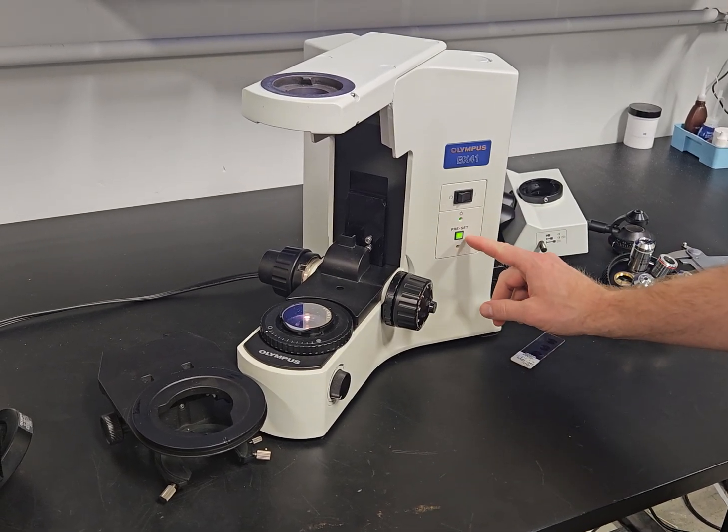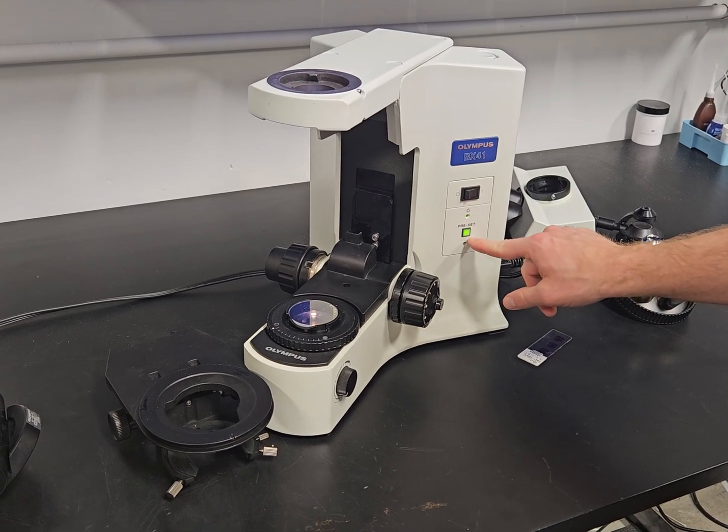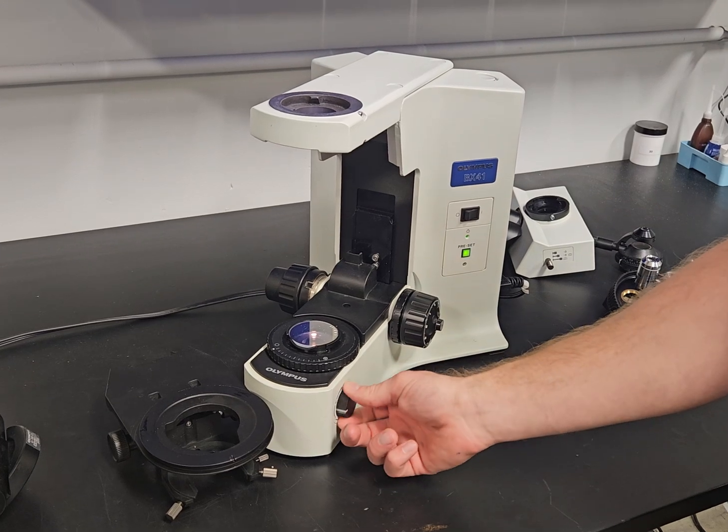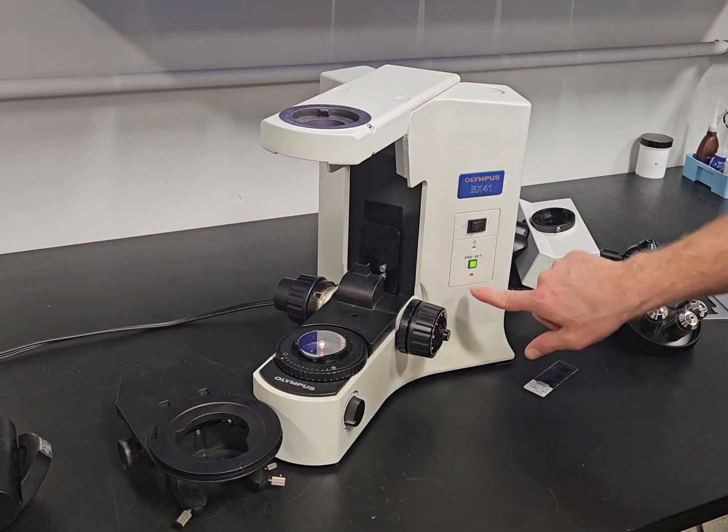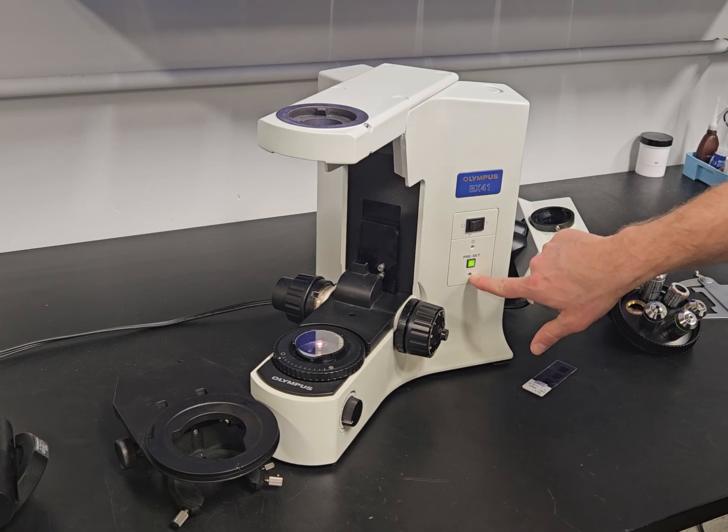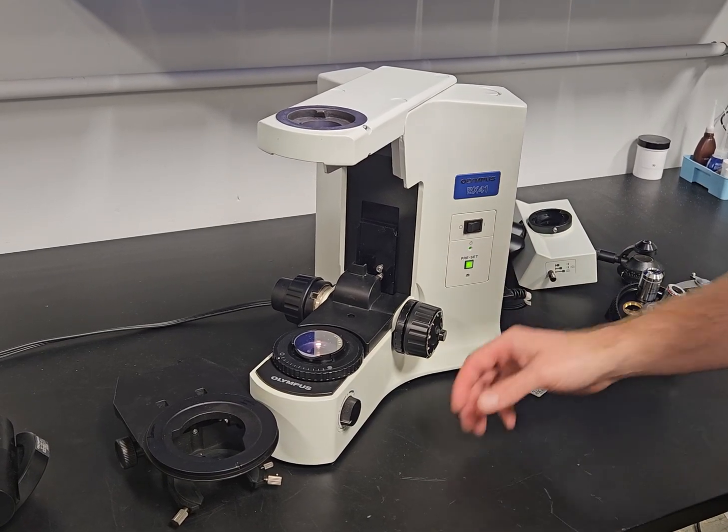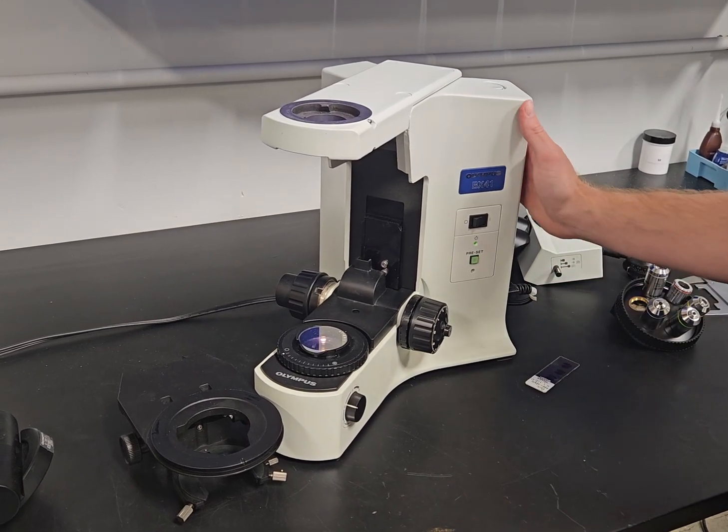If this is pressed and you'll notice that it illuminates green, what it does is it holds the light. So now we can't adjust the light. If you find the perfect light for you, you can adjust it with a little flathead screwdriver in there and set it. When that button is pressed, no one can change the light. So if you have multiple users, that's a really handy feature.